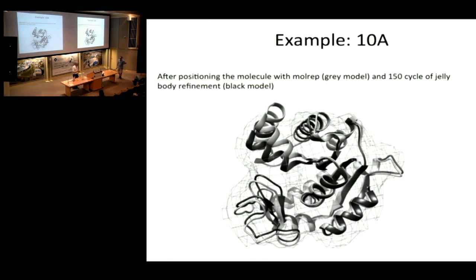It is very difficult. EM is not like crystallography. I've seen a 6 angstrom map where some portions are 4.5 angstrom, and you could do atomic model building there. I have seen 3 angstrom maps where only some portions are at 4 angstrom and the remaining are lower. It is very difficult to give a number. You just do refinement and overfitting analysis, and then say whether you can or may not do it.